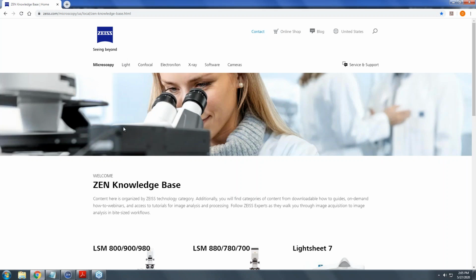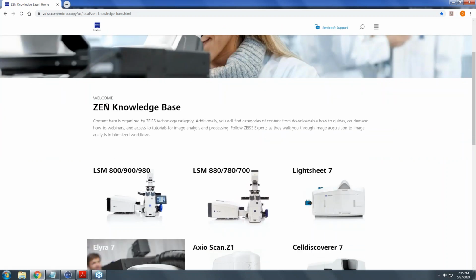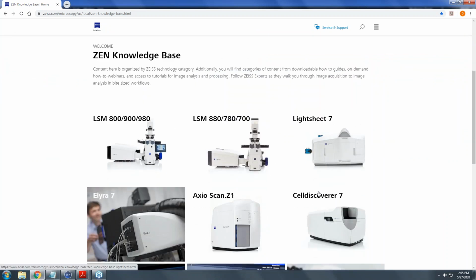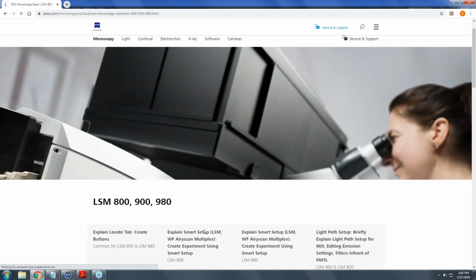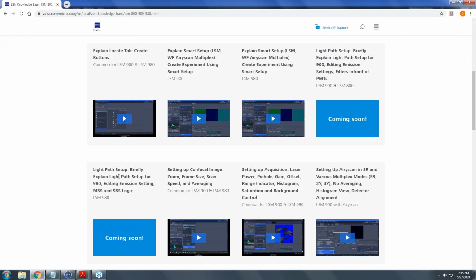We've taken time at ZEISS to bring together a whole bunch of videos, webinars, tutorials by instrument. So those of you who are using specific instruments, for example, an LSM 800, 900, or 980, there are multiple videos here, how-tos, for example, light path setup, explaining different tabs here.